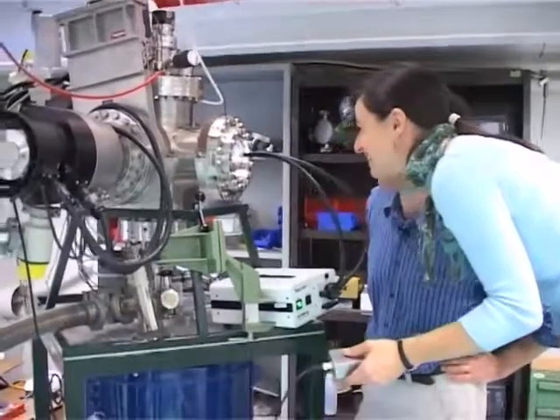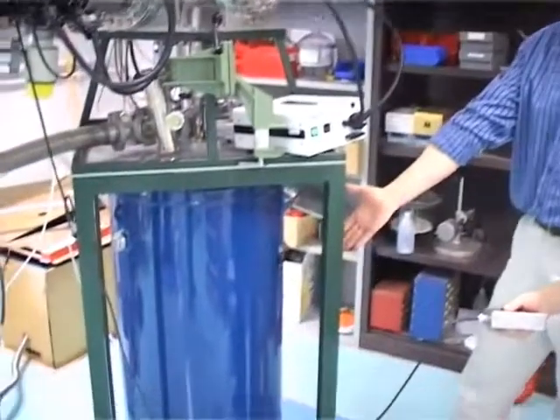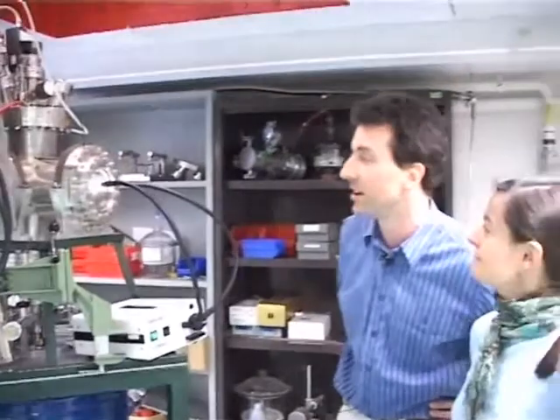So this is a low temperature scanning tunneling microscope. What you see here is the Kraustat which is made for cooling the instrument which is placed into this UHV chamber.